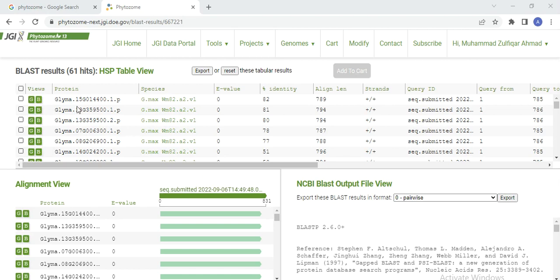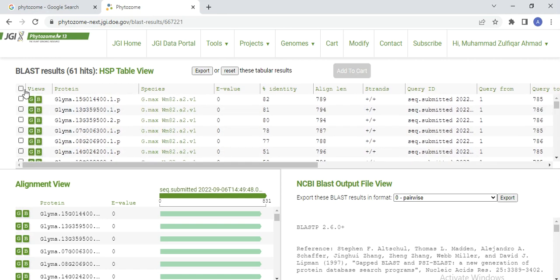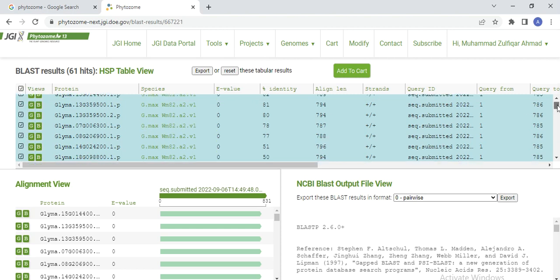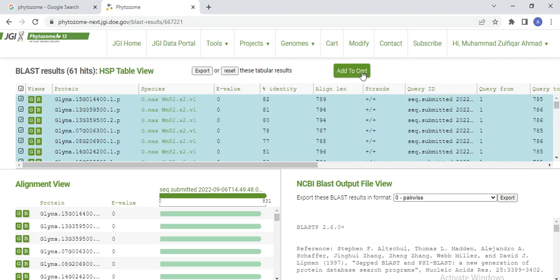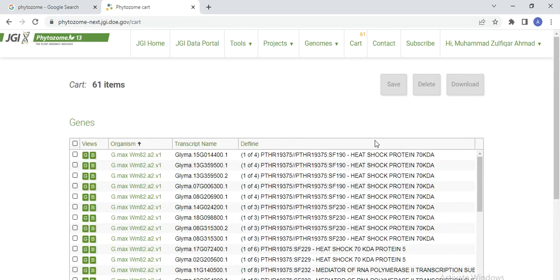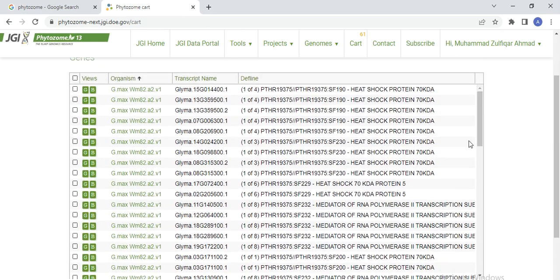Here I found these transcripts — the number of transcripts equals the number of genes. You need to select all, and then use Add to Cart. Here 61 items are added. Then go to your cart and click on it — here you will see all your transcripts or gene details.